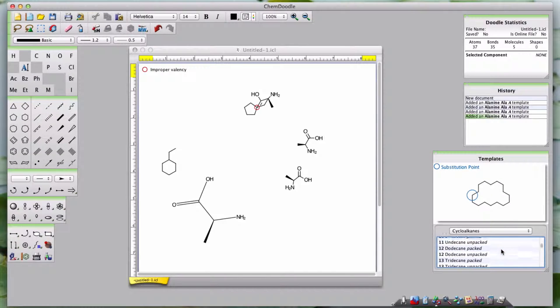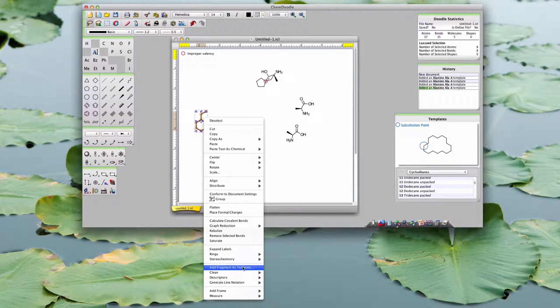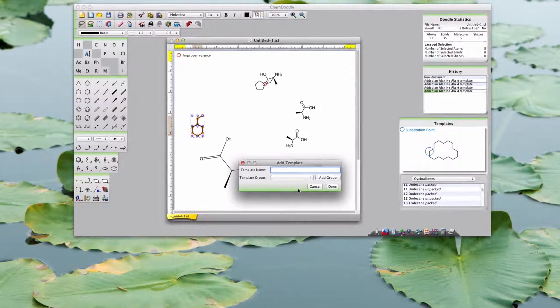If you want to add a new template to the template widget, select the fragment you want to add as a template. Right-click and choose Add Fragment as Template. Give the template a name.